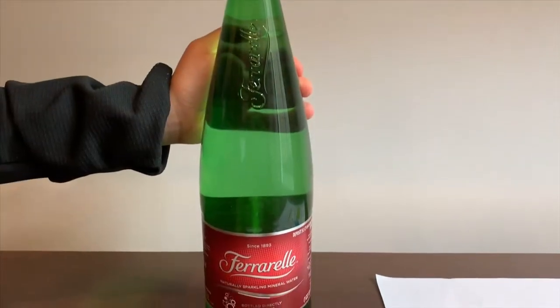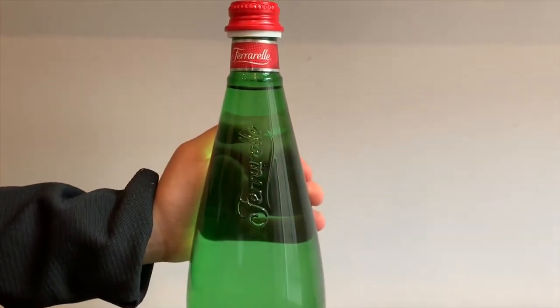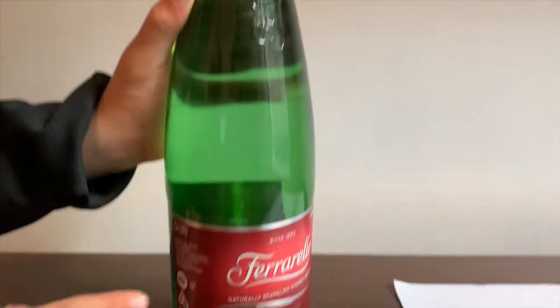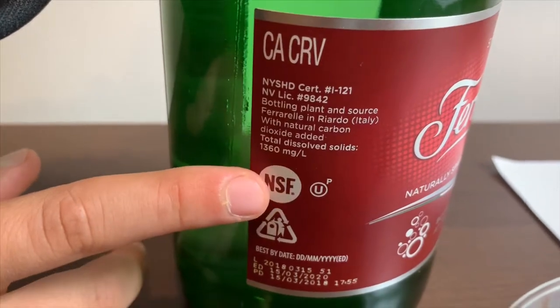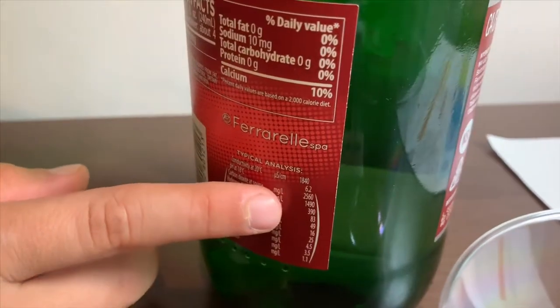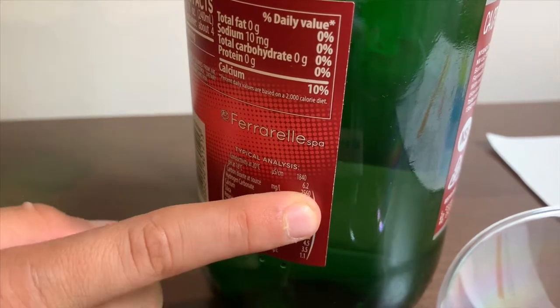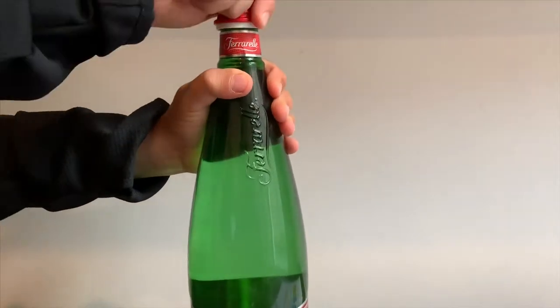This is a natural sparkling mineral water bottled in Italy. It says the TDS is supposed to be 1360 and the pH is supposed to be 6.2. Let's test and find out if that's true.